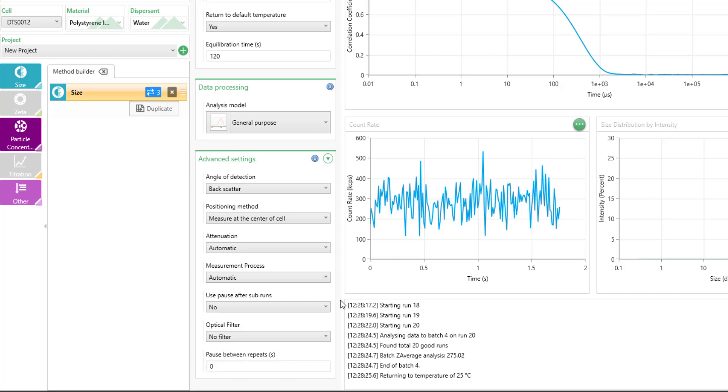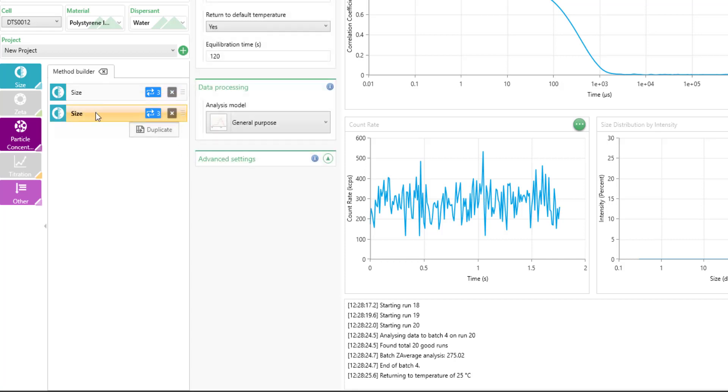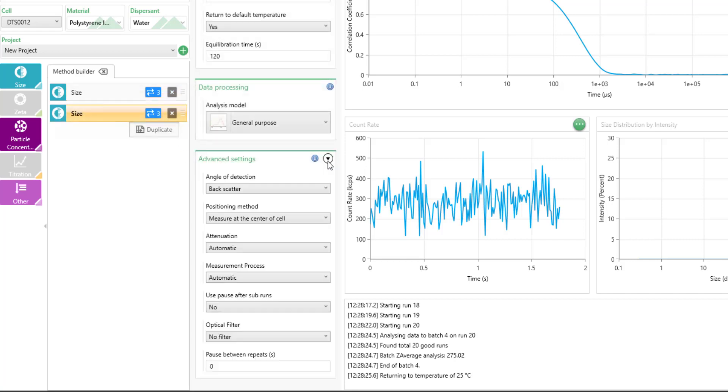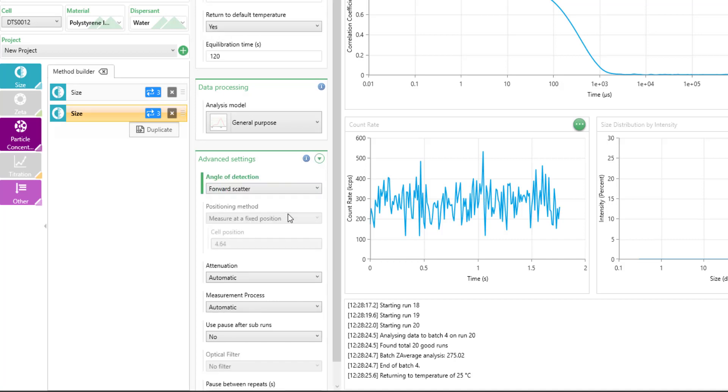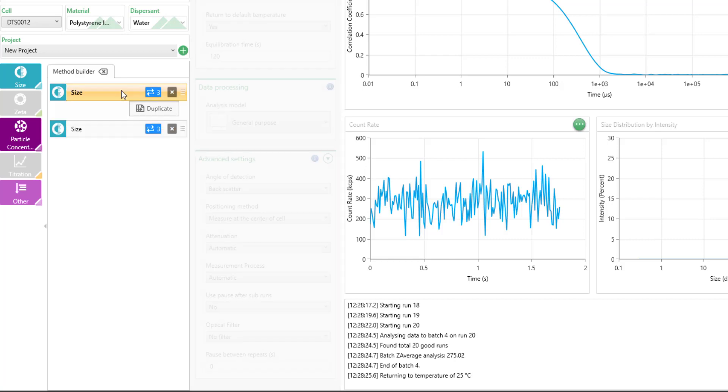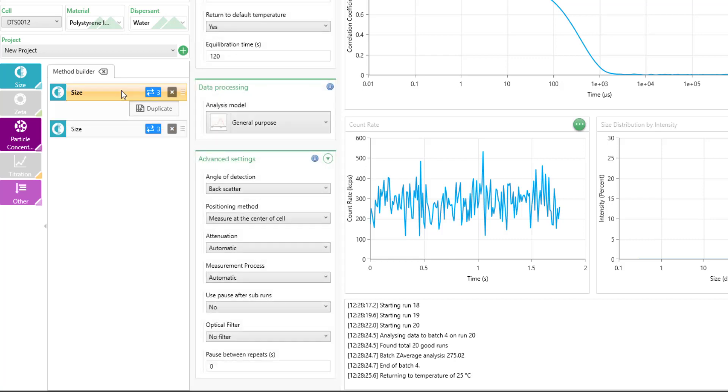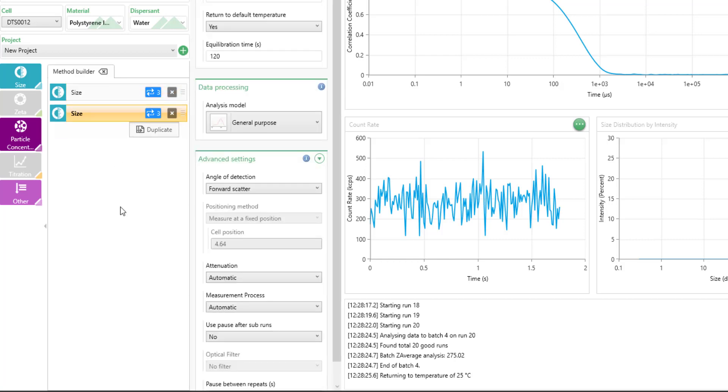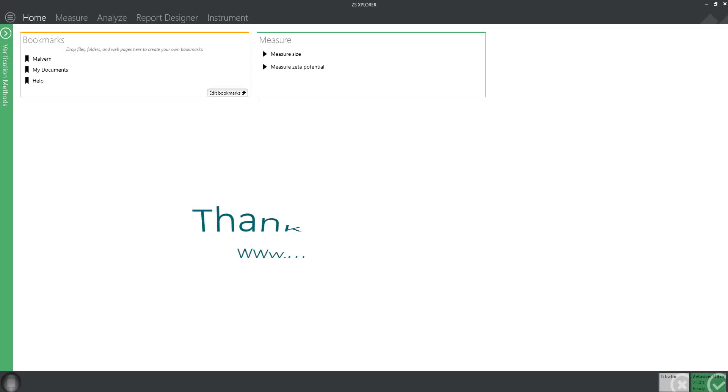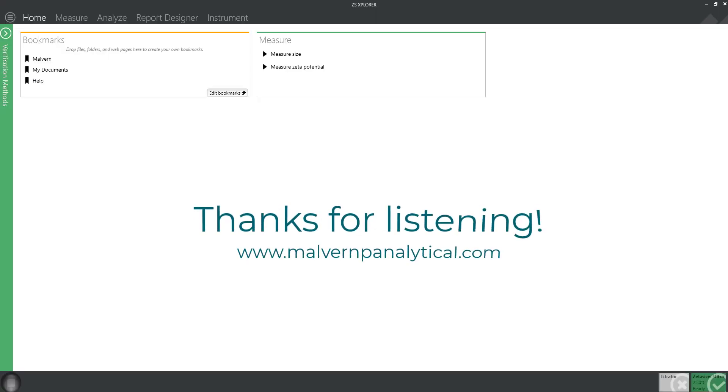Now let's say you're interested in making some of these changes to your method and seeing how that affects the results. That's really easy with this software to duplicate a sizing measurement of the current settings and then making a change such as to the angle of measurement. Now you'll see that you have a measurement at backscattering and then another measurement at forward scattering where you can directly compare results.